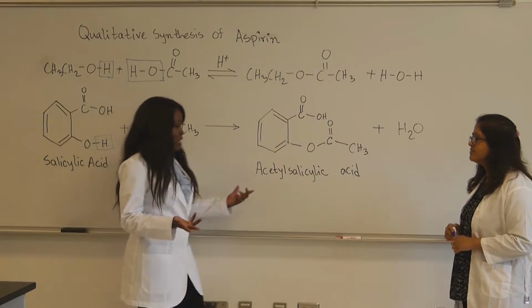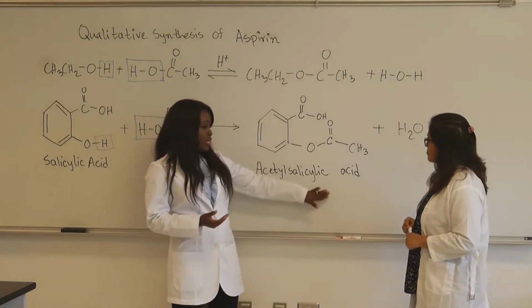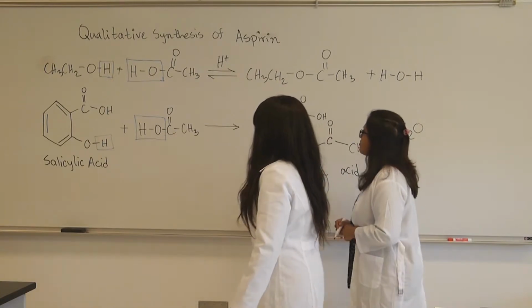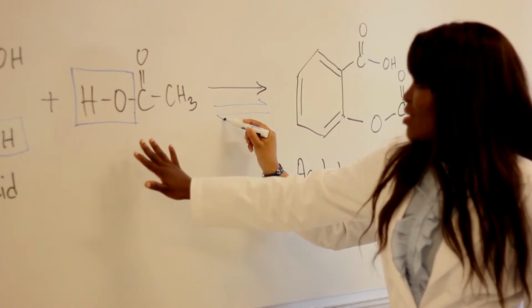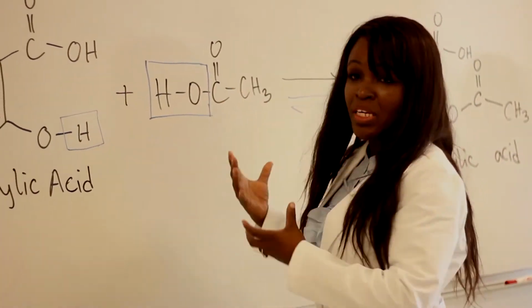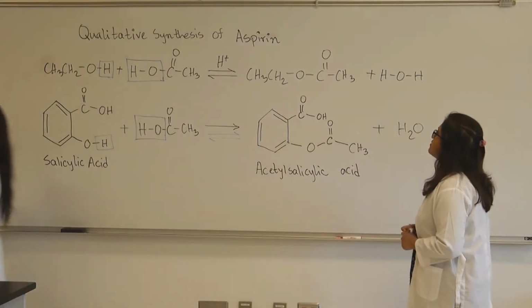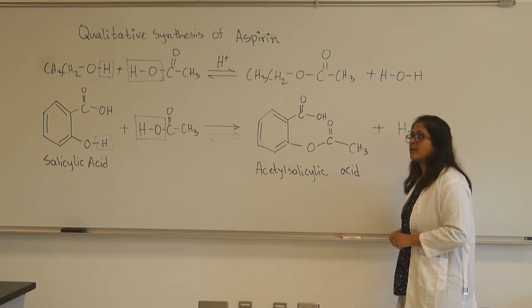In aspirin, you have acetylsalicylic acid. If you have very old aspirin, this reagent will react with water, and this reaction is actually reversible. So it reacts with water and begins to break down to form acetic acid, with the vinegar smell, and you'll begin to smell this in an old bottle of aspirin. If you smell that and take it, it will irritate your stomach. So it might be time for you to go and buy a new bottle. Exactly. So this is the synthesis of the active ingredient of the aspirin, acetylsalicylic acid.